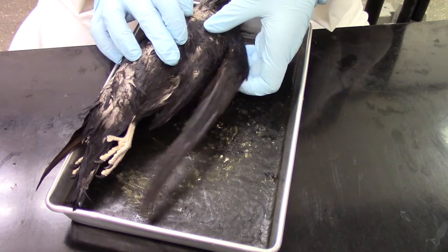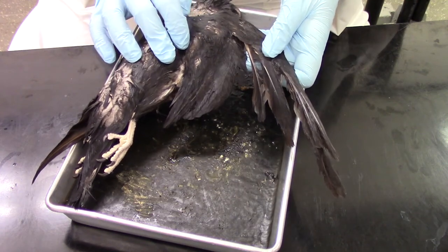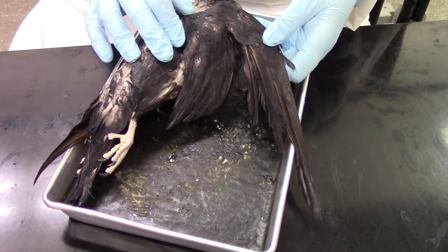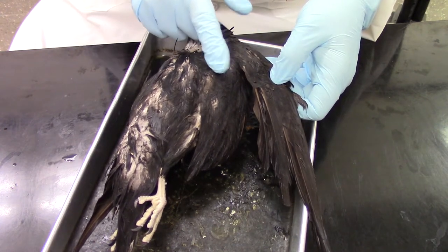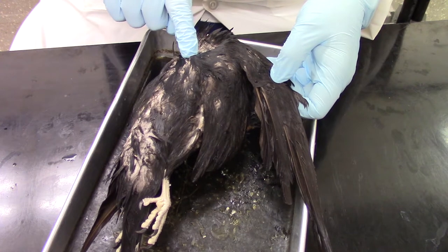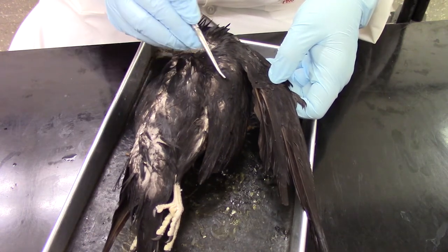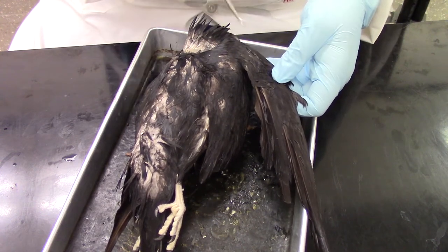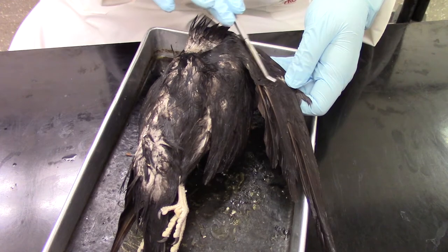While we're on the dorsal side, we can extend the wing to take a better look at the feathers. We can see the joints here. Where my finger is, this would be the equivalent of the wrist joint. Here would be the equivalent of the elbow, and here would be the equivalent of the shoulder. The humerus would be running here, the radius and ulna in this direction, and the carpals, metacarpals, and phalanges heading down in this direction.